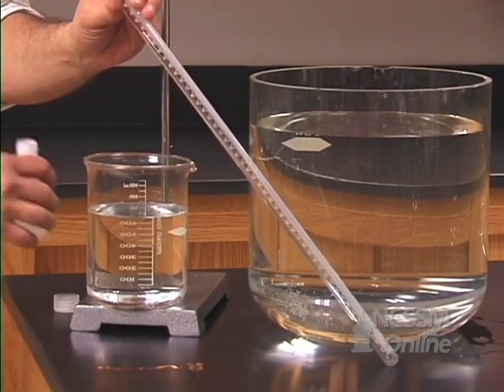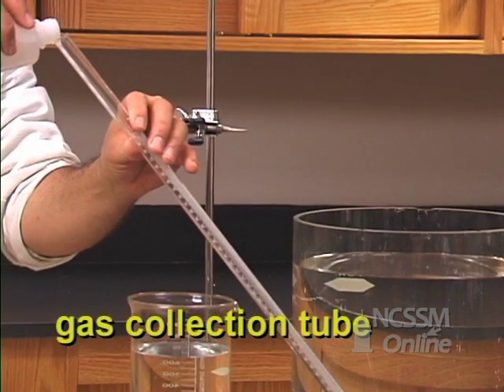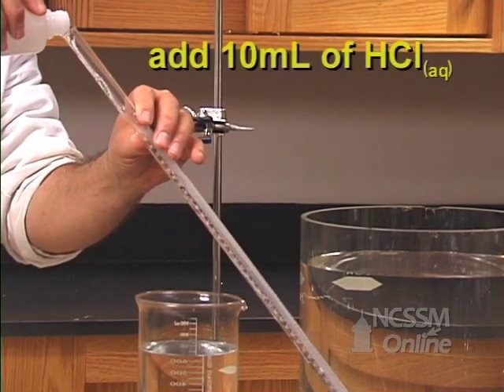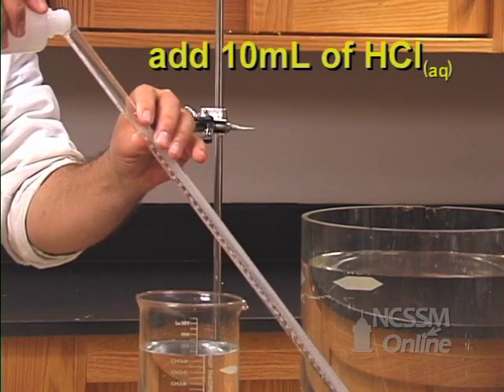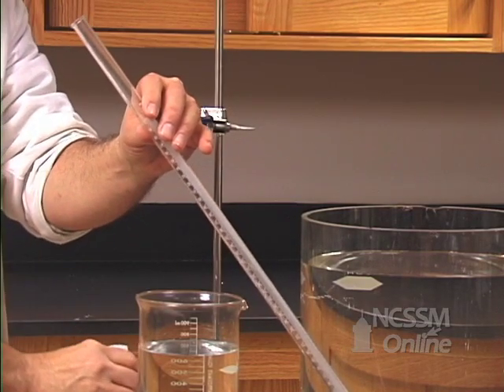We have a gas collection tube that is graduated in milliliters and tenths of a milliliter. I'm going to carefully add about 10 milliliters of 6-molar hydrochloric acid to the tube. The amount of hydrochloric acid is not critical, seeing how it will be in a very large excess.